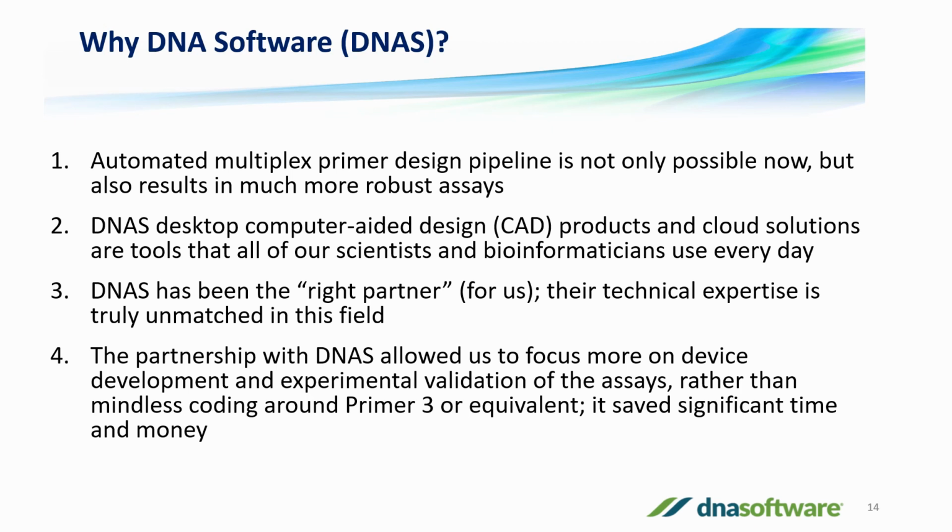They have been really helpful in the design, and this is not just on the validation, but also on making the methods that we have much better. So the result was, we were worried about how much the design of these panels would take time when we're actually pushing our products, and we are on sort of limited budget in a startup.